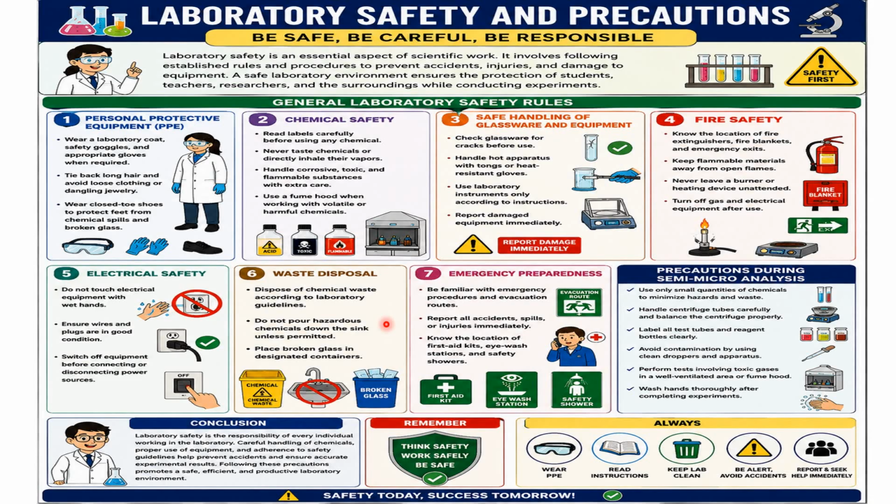And this hazardous waste, we should not directly pour it into the sink. If it is hazardous, you have to follow the separate disposal procedure, or you have to convert it into a less hazardous substance and throw it into the sink. Then emergency preparedness: be familiar with the emergency procedures and evacuation routes.